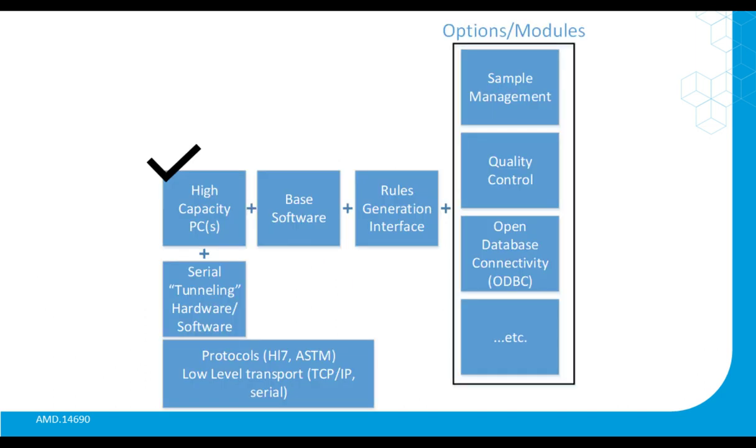So what is middleware? It's basically software that sits on a high-capacity PC, and that could be cloud-based as well, that has the physical and logical connection abilities to various lab instruments that are capable of communicating by one or more protocols, whether that's serial tunneling or whether that's using the more up-to-date standard HL7 protocols. Middleware is helping to make sense of a whole lot of discrete information, and it does so by employing some set of rules or a rules engine that governs the disposition or the next steps or the transformation of that discrete testing information.